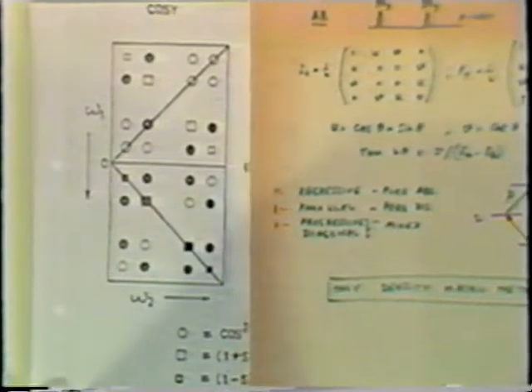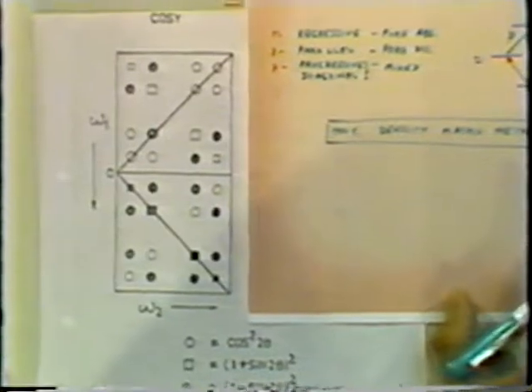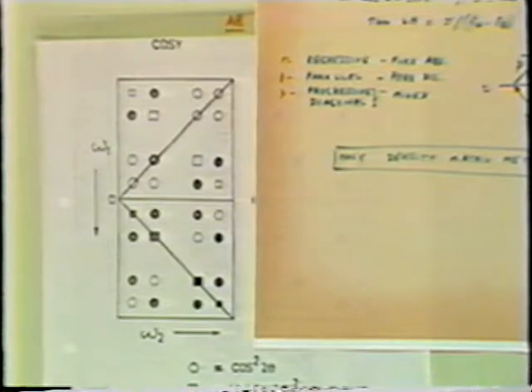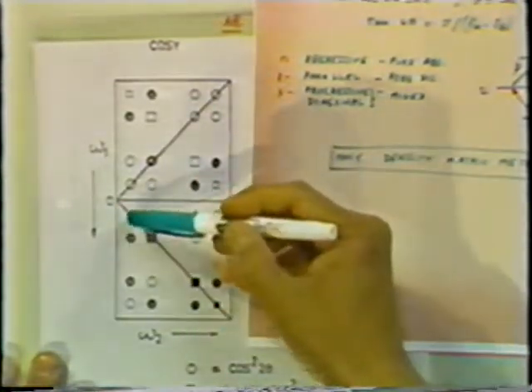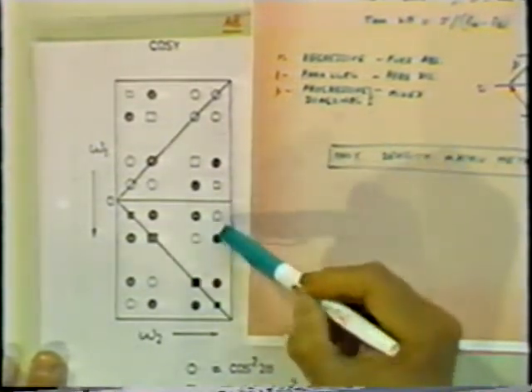The calculated spectrum is given on this transparency. And please don't look at the right-hand side of this, because we will look at that after we study multiple quantum transition spectroscopy. What it says is that the spectrum of two strongly coupled spins will look something similar to what we have for weakly coupled, except that, for example, the intensities along this diagonal will show smaller, larger, larger, and smaller, while the cross peak part will have the same 1, 1, 1 intensity.